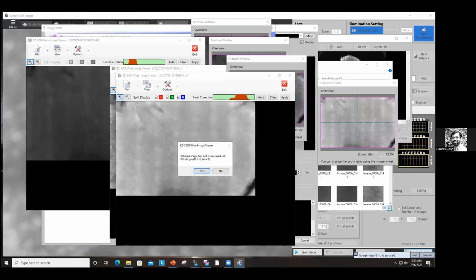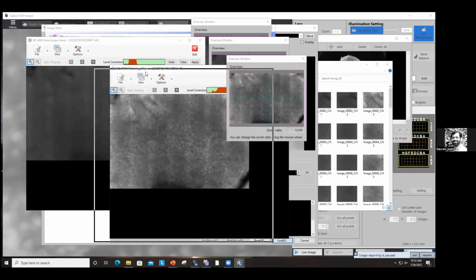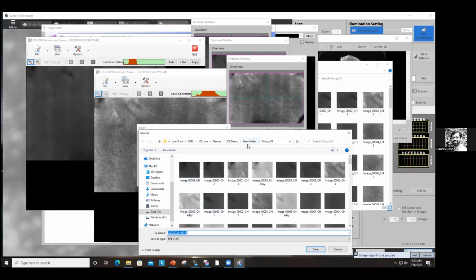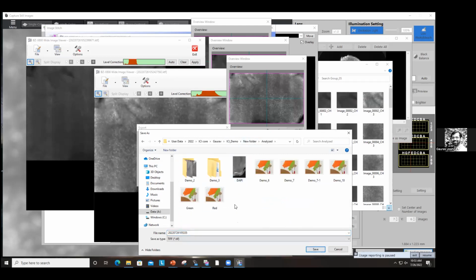So I'm going to exit this out and not save it. The 3rd channel is what I'll start saving as. Now again, the names are very random over here, so you need to know the sequential order of the channels in which your images are opened. So I'll go ahead and say export in the original scale, say okay. I know my last one is, I'll go to my folder and call it analyzed. Open, I'll call this group_5.